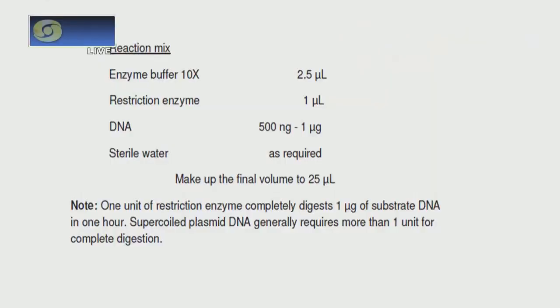It will also vary with the purpose of your experiment, the purpose of your study. It depends on the copy number also sometimes. If it is a low copy plasmid, then it is different. If it is a high copy, then it might differ. So there are several conditions. My main intention is to let you know how to set up a reaction, what components are added, what temperature you need to maintain, and how many hours you need to maintain the reaction. That is how you set up a reaction.